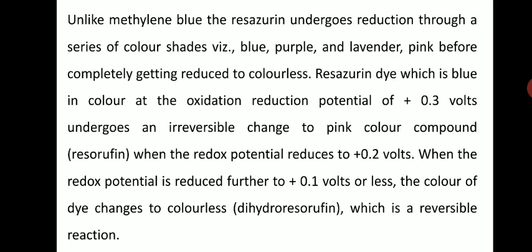Resazurin dye, which is blue in color at an oxidation reduction potential of plus 0.3 volts, undergoes an irreversible change to a pink colored compound. That pink colored compound is known as Resorufin. When the redox potential reduces to plus 0.2 volts, and when it is reduced further to plus 0.1 volt or less, the color of the dye changes to colorless, and that colorless compound is known as dihydroresorufin, which is a reversible reaction.